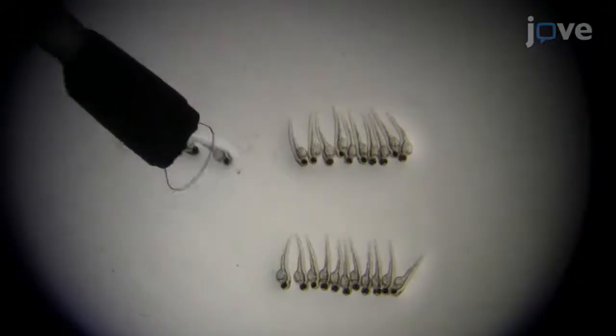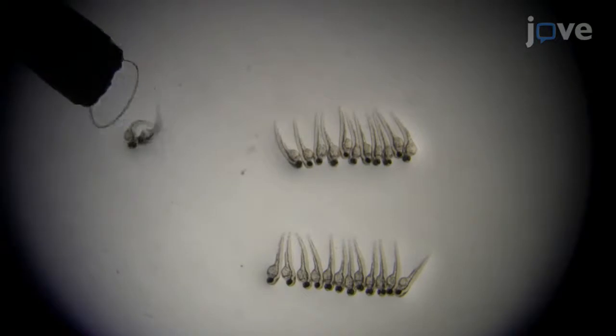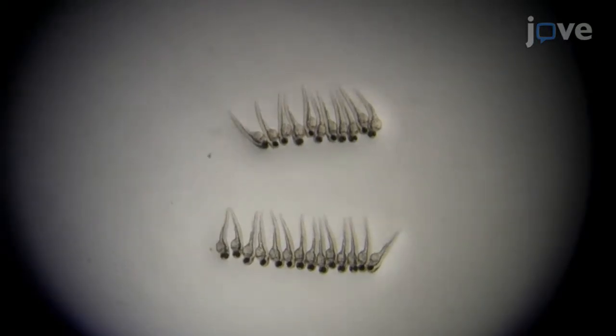This protocol demonstrates a larval zebrafish Aspergillus infection model, which we can use to investigate innate immune responses to this fungus. The main advantage of the larval zebrafish model is that we can visualize immune cell-pathogen interactions and infection progression inside a live host animal throughout a multi-day infection. Findings from this model may be applicable to the discovery of new therapeutic targets to treat invasive aspergillosis in immunocompromised patients.